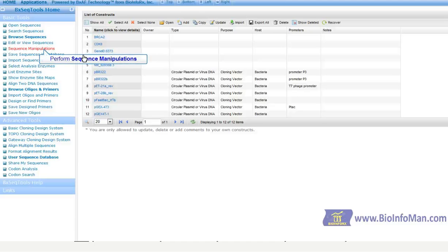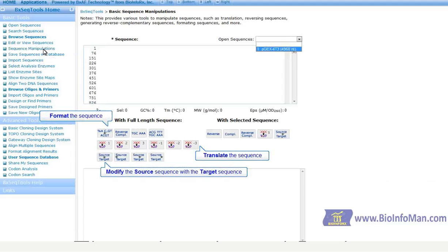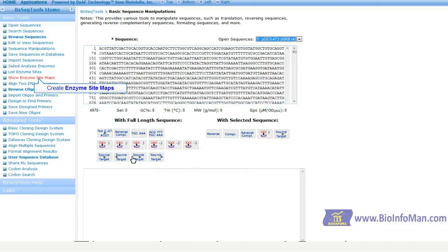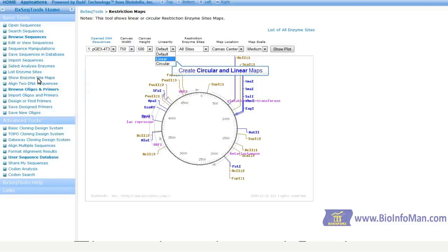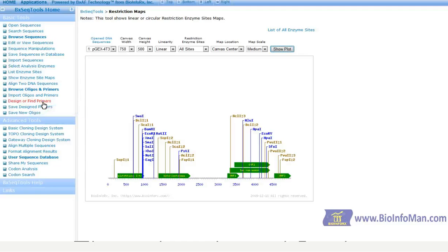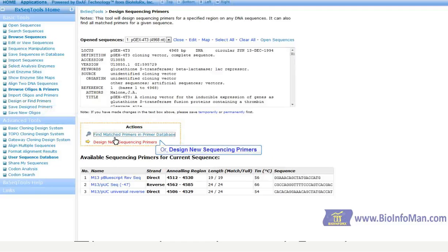The Sequence Manipulations tool performs multiple functions, like formatting, translating, and easy modification or manipulation. Create circular or linear enzyme maps. Easily find matching primers or design your own.